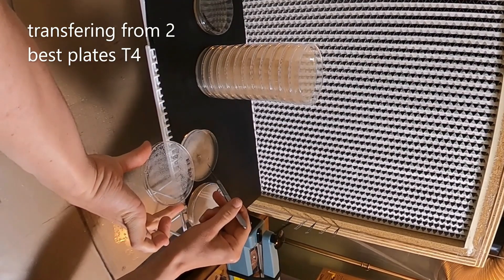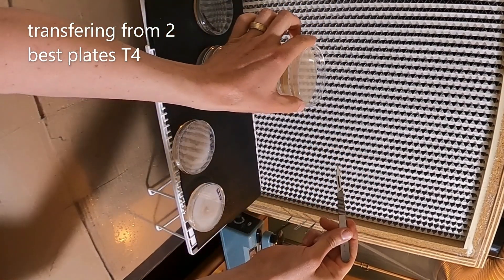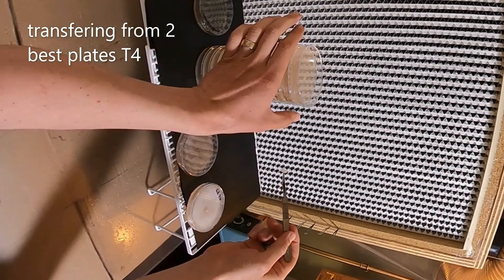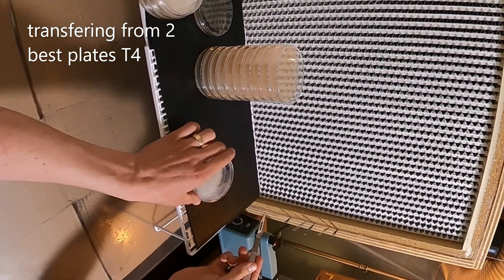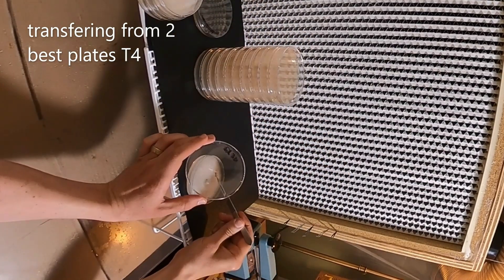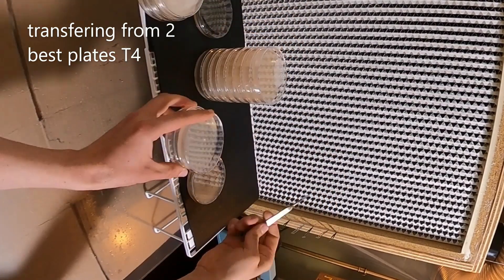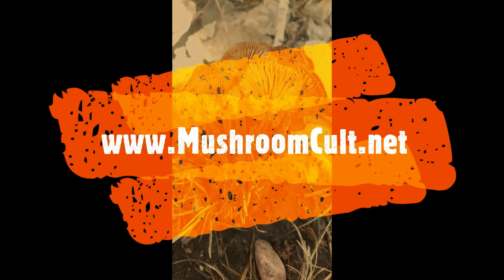Those plates turned out good, but I just want to do another transfer of the best plates — this is maybe four days later. Now I'm copying the best ones I found. The next step is to make grain jars: I'm going to take these plates and transfer them into sterilized grain jars. From there I'm going to move it onto hardwood sawdust and fruiting — that'll be in the second video. Right now I'm just making backup cultures so I'll have enough to make grain jars.